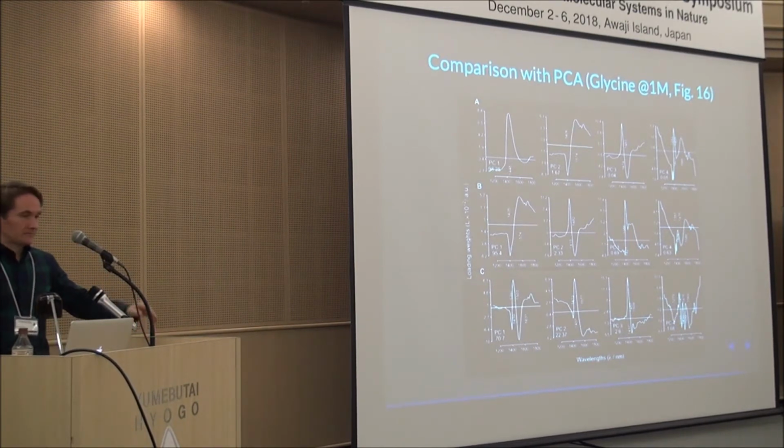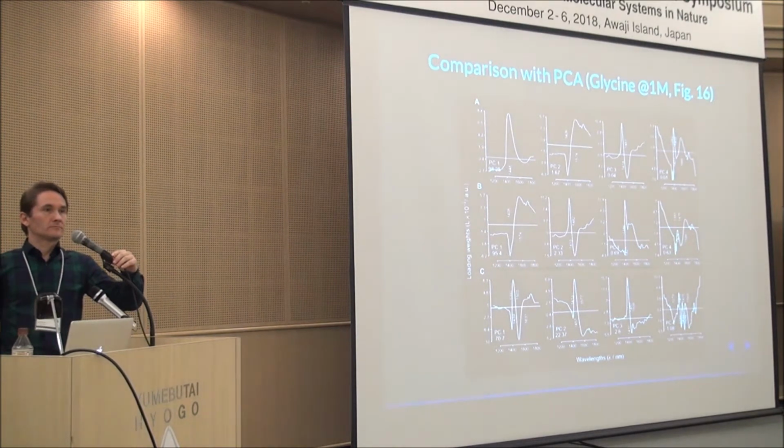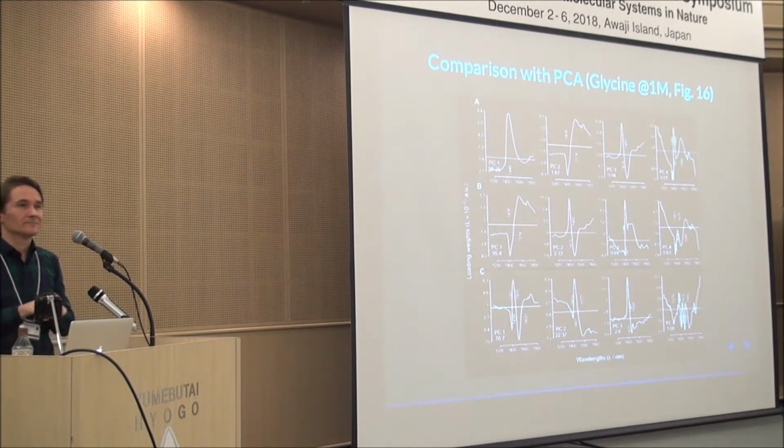Just a note. There are two temperatures that are causing non-linearities, so you have to be careful. 25, 30, 35. Strange temperatures. So bear in mind.